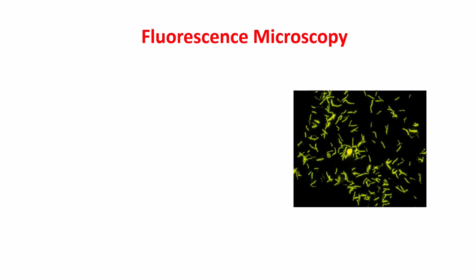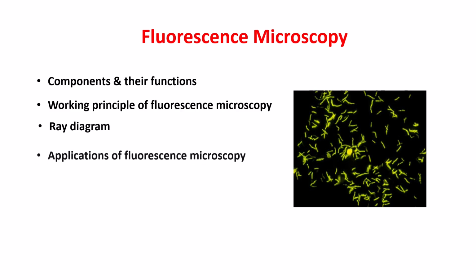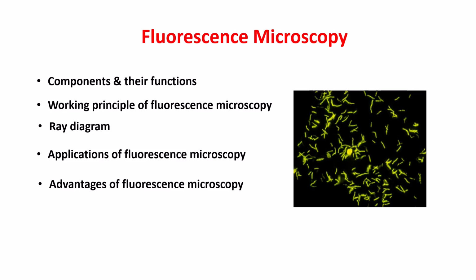Hello friends, in this module we will be talking about fluorescence microscopy. We will cover components and their functions, the working principle of fluorescence microscopy, ray diagram, applications of fluorescence microscopy, advantages of fluorescence microscopy and limitations of fluorescence microscopy.